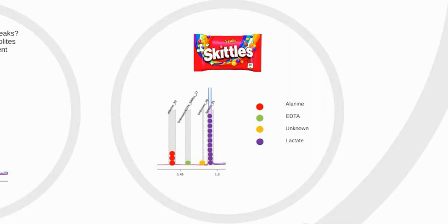We can then conduct statistical analysis to determine which are statistically significant and therefore differential between our groups, and we can start to map these metabolites to metabolic pathways, which allows us to infer the functionality and physiology of what we are exploring, which may provide insight into mechanisms that change with disease, for example.